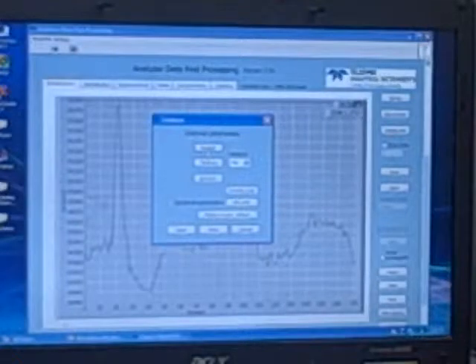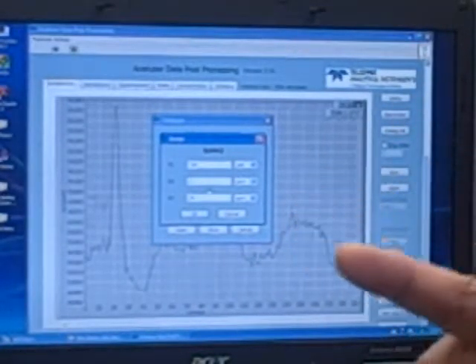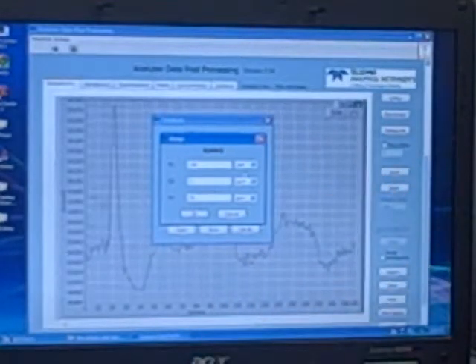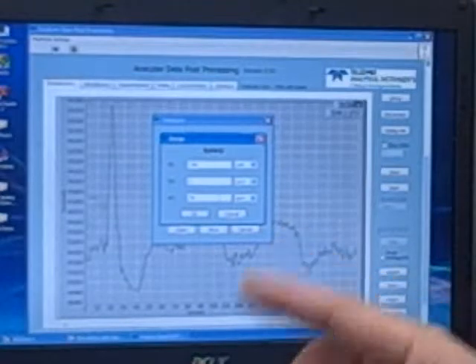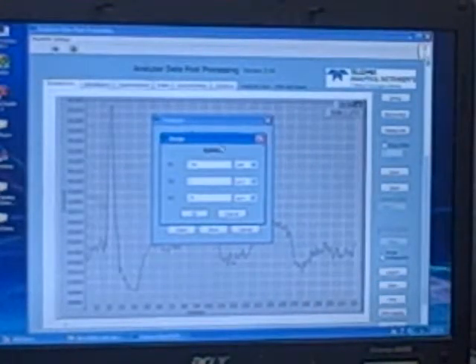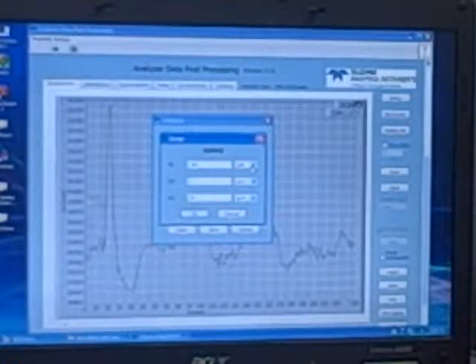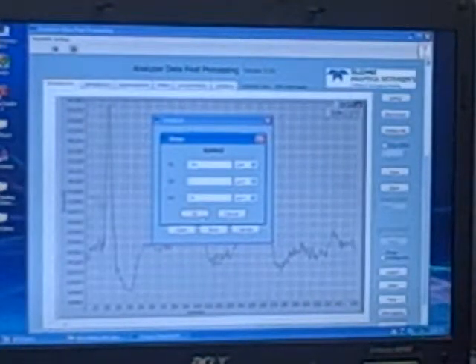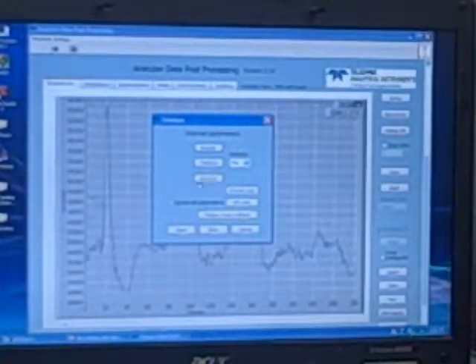The range, if you open it, it's defined three ranges. We have to do it manually, no automatic range. And that only have impact on the 4-20 milliamps on the analog output. Okay? You click it, open, review, everything is okay, the unit is okay, you have choice, ppm and the percent. You click OK. You have to click OK. If you don't click it, you get trouble later.